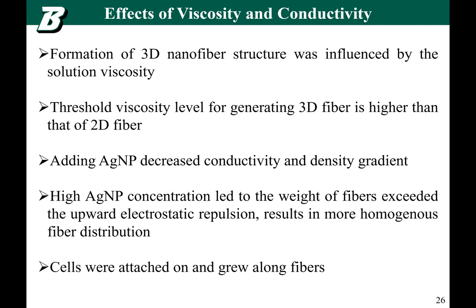And higher silver nanoparticle concentration led to the weight of the fiber exceeding the upward electrostatic repulsion, resulting in more homogeneous fiber distribution. Because if we did not add the silver nanoparticle, then the fibers will have electrostatic repulsion force that will repulse the fibers from depositing to the bottom and central area. And cells were attached and grew along the fibers, even with the silver nanoparticle incorporated.